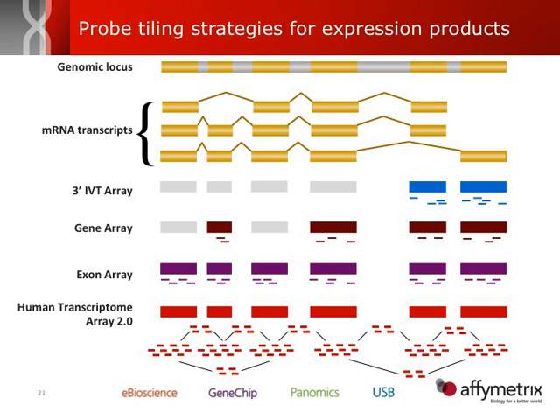But we go one step further, and because this is a known isoform, we know that there is a junction between exon 1 and exon 3. So we tile down 4 more probe sets that interrogate the junction between exon 1 and exon 3. So this probe set we will actually get signal from, and that's our 4th piece of evidence telling us that there is an alternative splicing event happening at this particular location.